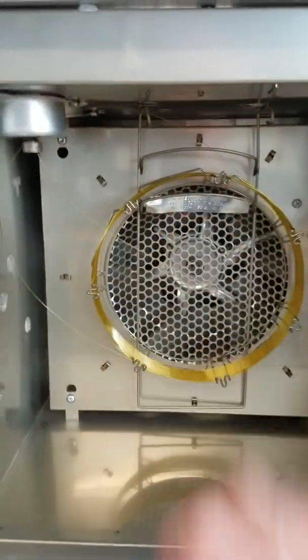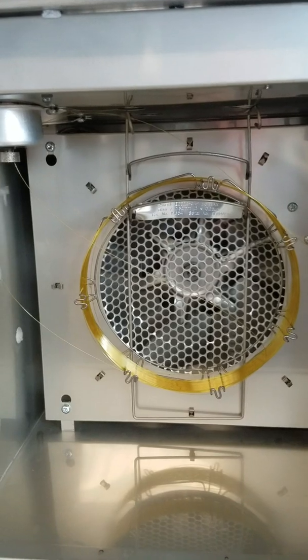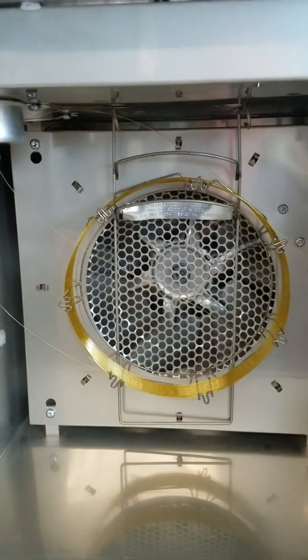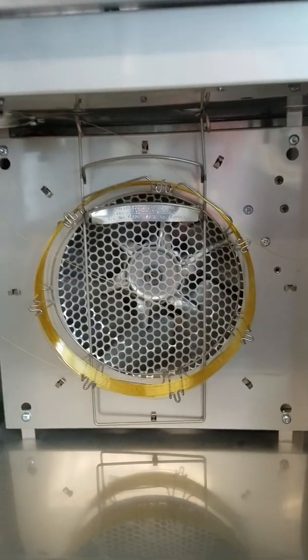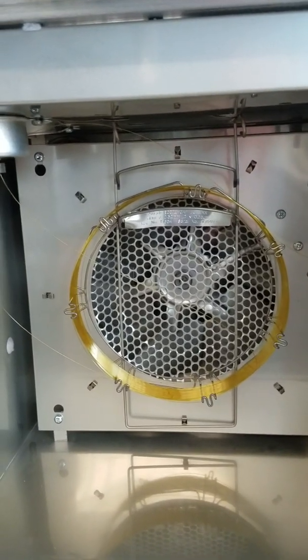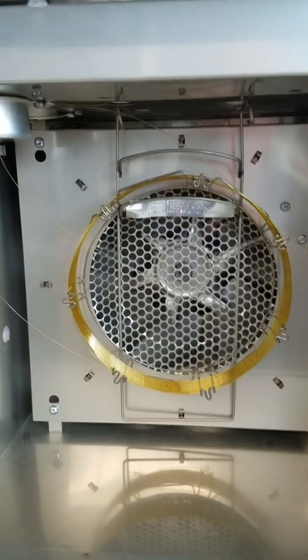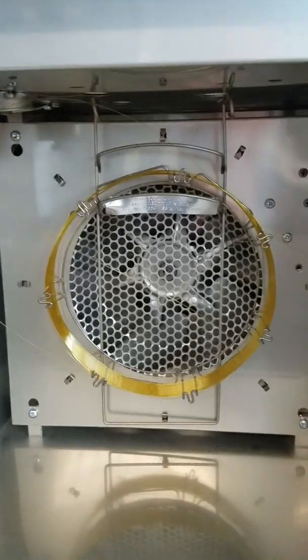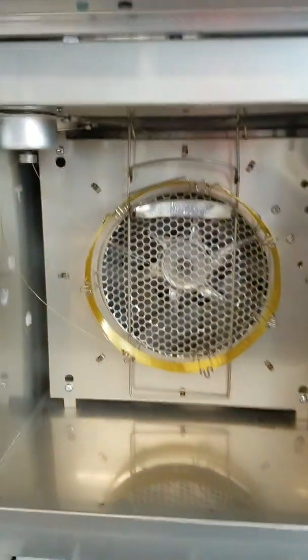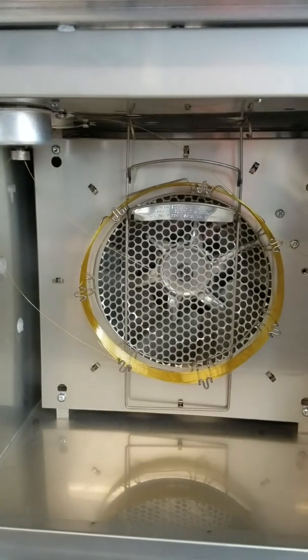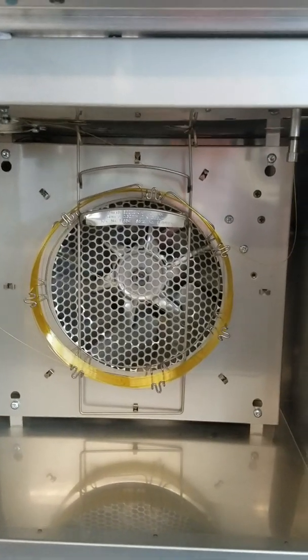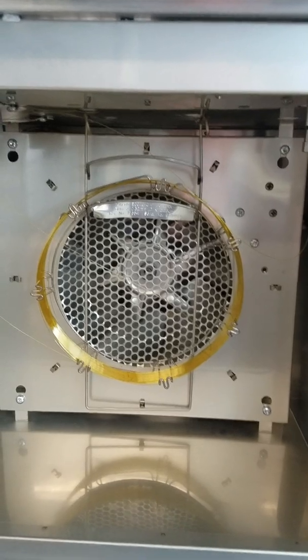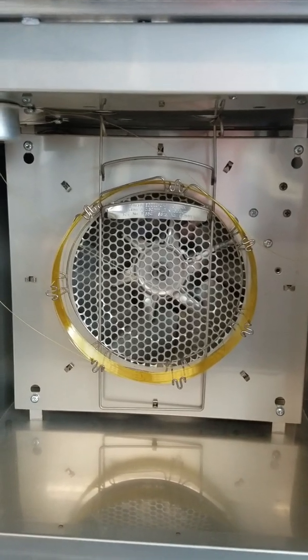Given that the analytes we're interested in analyzing for in this whiskey sample are alcohols or polar compounds, we're using a polar column, which means it has a polar stationary phase on the lining of this capillary column. I've actually done an injection of the standards using both this polar column and a non-polar column. You can see how the analytes elute off in different orders based on what type of stationary phase you use.